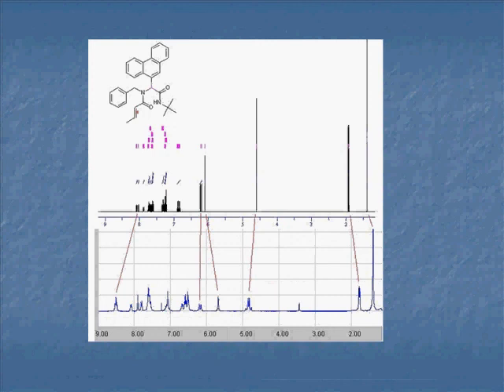And ChemSpider recently has the ability to predict NMR spectra. So there's a button for this record, and if you click on it, it generates this spectrum. I put it next to our experimental spectrum to show that you still need to be a chemist, you still need to have some common sense, but it's certainly pretty helpful, to use your background and get a rough idea of where those peaks should be. I think it's pretty neat for a free service.